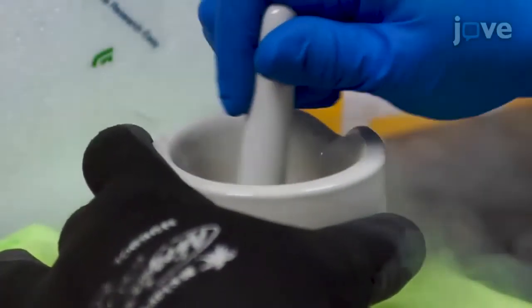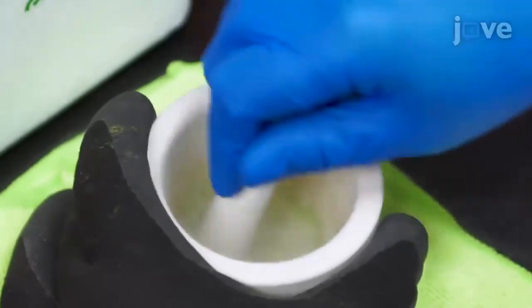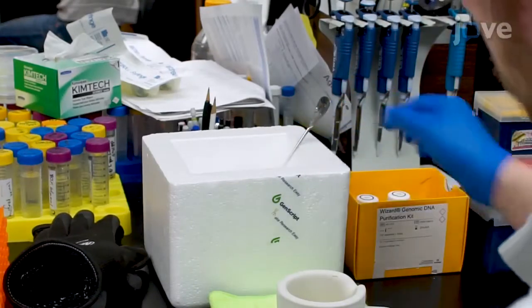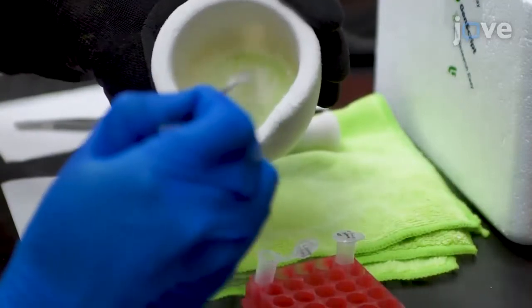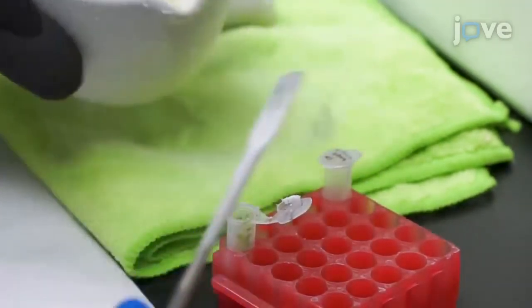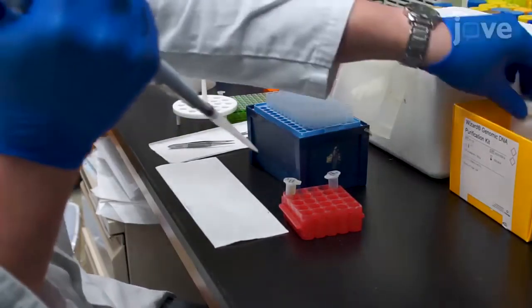Quickly start grinding the leaf tissue with the pestle until the liquid nitrogen evaporates and a fine green powder remains. Next, chill a metal spatula in liquid nitrogen for 10 to 15 seconds. Then, use the cold spatula to scoop the ground tissue from the mortar into a 1.5 milliliter microcentrifuge tube. Use a 1,000 microliter pipette to add 600 microliters of nuclei lysis solution to the sample.